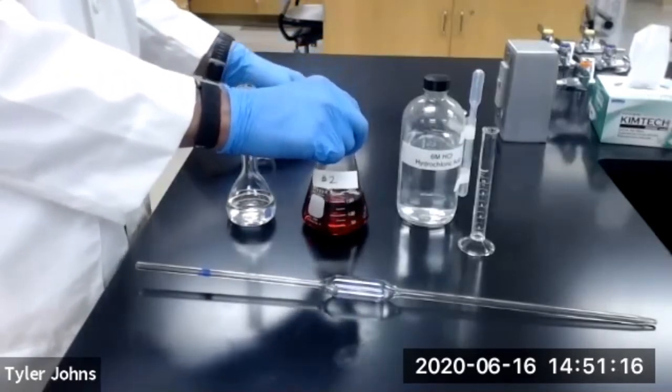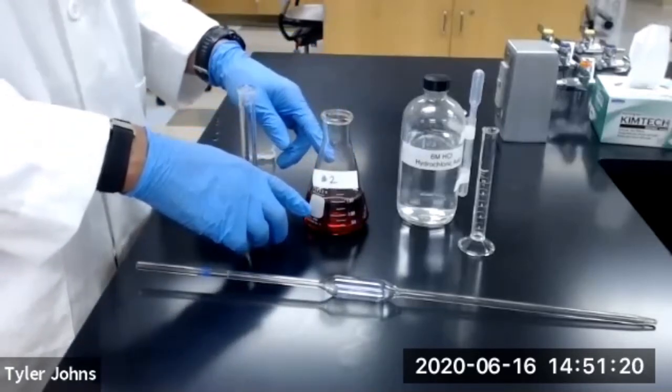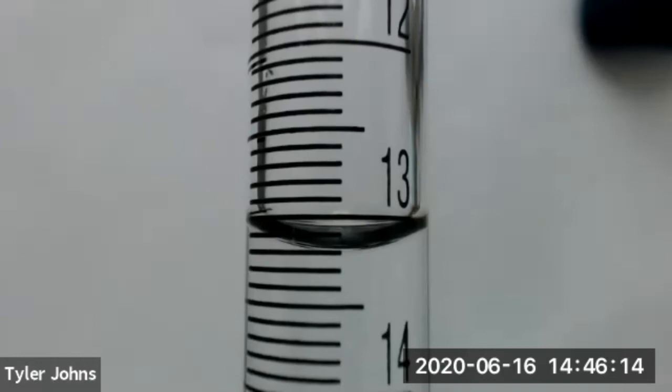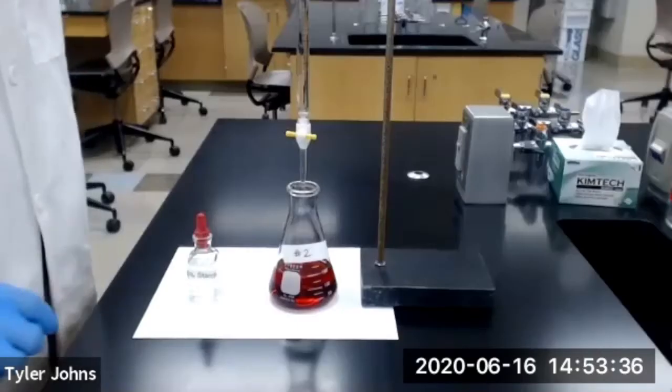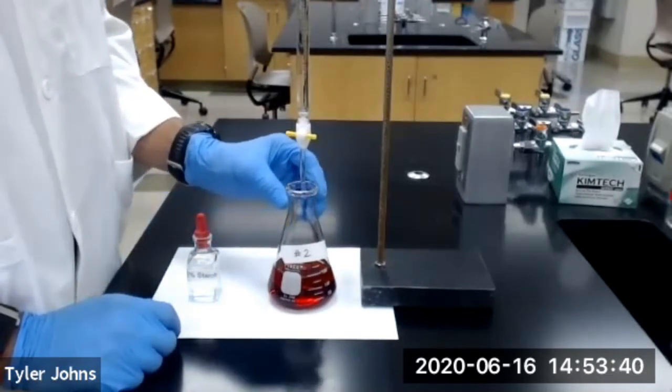We will now immediately begin the trial number 2 titration. This is the initial volume of the burette for trial number 2. Be sure to record this initial volume on your data sheet to the correct number of significant figures. Note that it is just slightly over 13 milliliters. We're immediately starting titration of trial number 2.